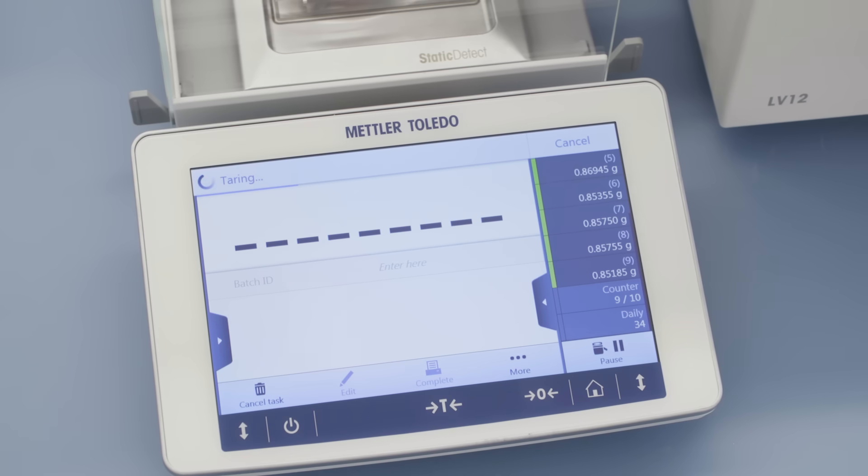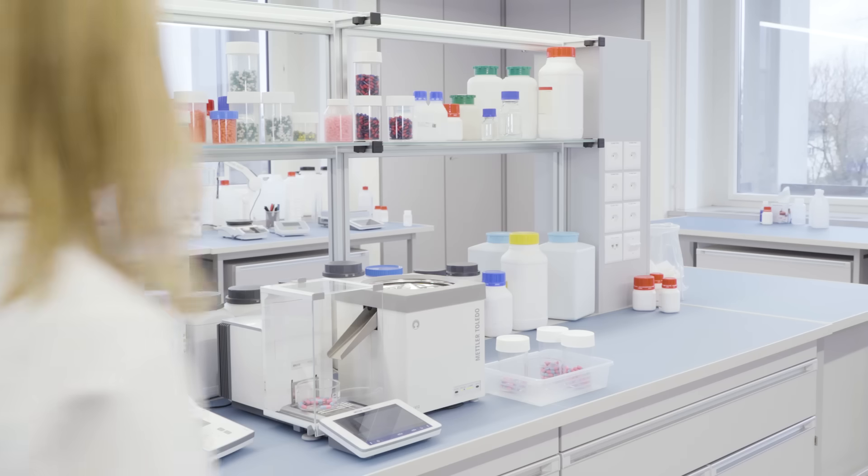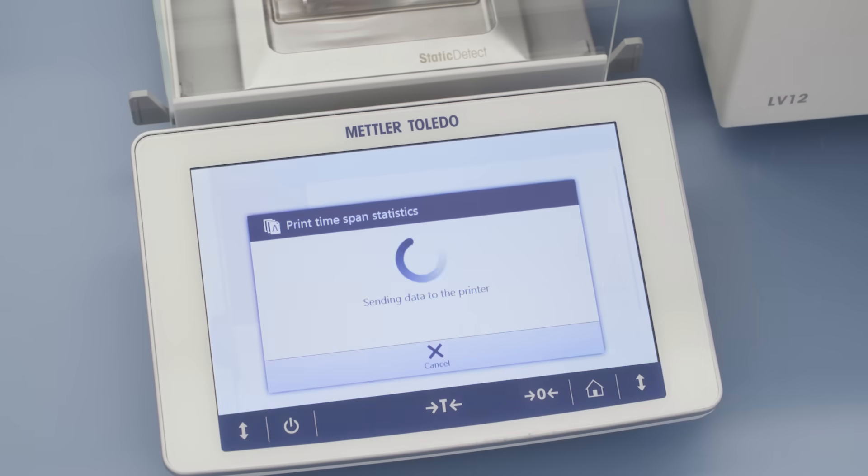Once the predefined number of specimens have been weighed, advanced statistics are calculated automatically and compared with the acceptance criteria. The results are easily printed out and can be archived to ensure traceability.